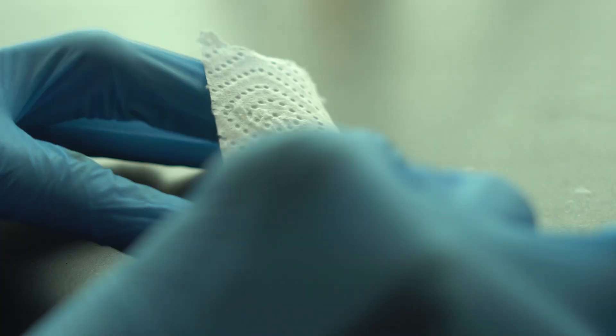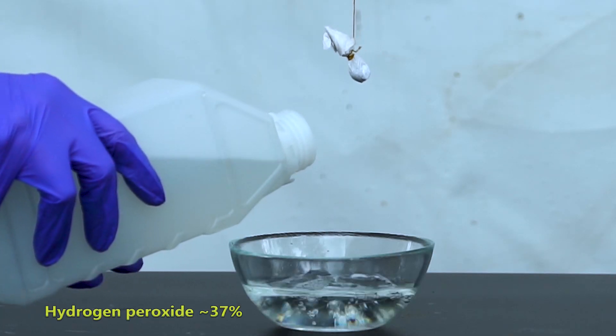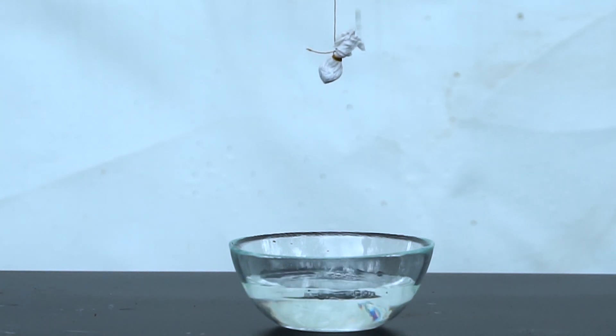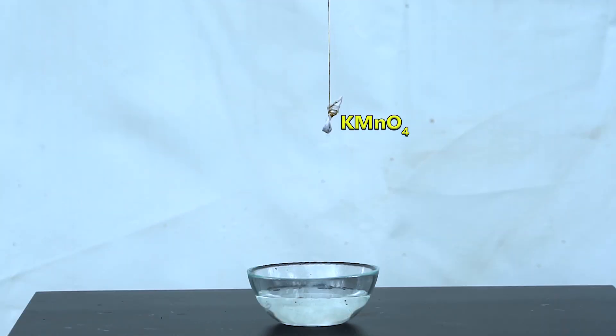I wrap potassium permanganate in a paper towel and tie it to a thread so that it reacts with hydrogen peroxide first, and after a violent reaction with the release of oxygen begins, I dip the potassium there.